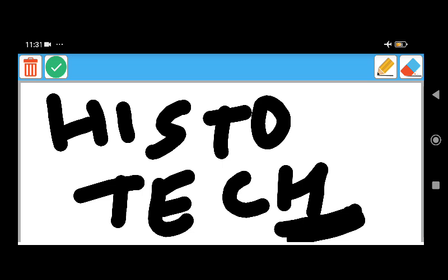Embedding ring and cassette: here the embedding is performed in a specially made base mold. The embedding ring is placed over the mold filled with wax and the tissue is embedded in the molten wax. After solidification of the wax, it is removed together with the cassette. The cassette fits into a purpose-made microtome clamp.